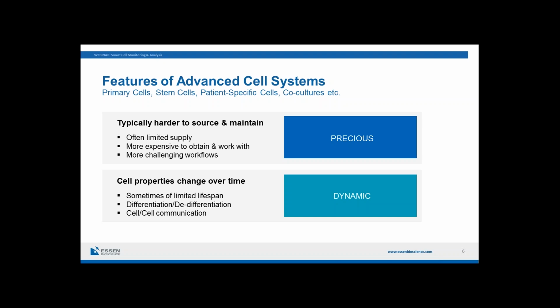The exemplification of this would be, for any of you working with CHO cells or HEK cells or HeLa cells, you probably get to the end of your working week and you throw away unused cells, you discard them, they're low cost, and you don't worry too much about that.